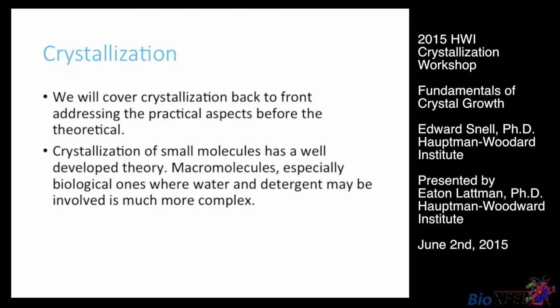Macromolecules are harder. They have water, detergent. There are often cofactors in there. And there are issues of order and disorder within the specimen that are not characteristic of small molecules. You don't often find a denatured skin of denatured protein when you're trying to crystallize sodium chloride.